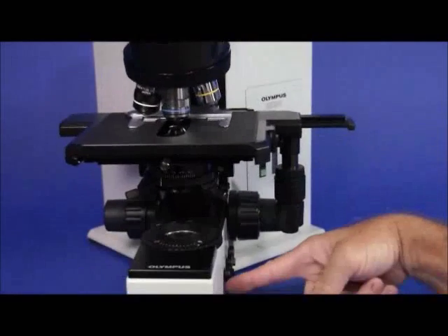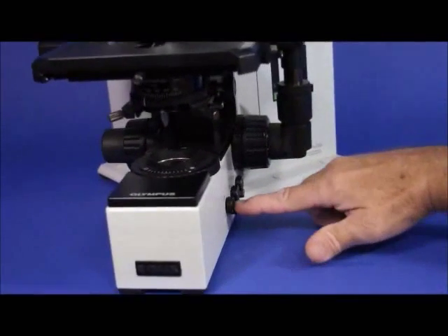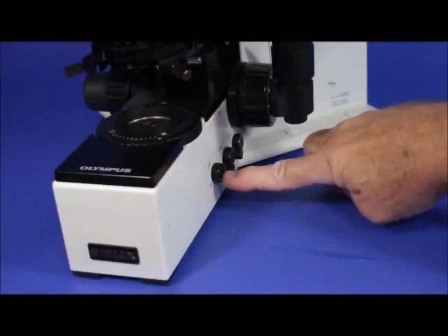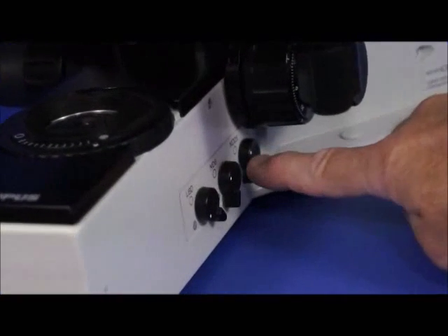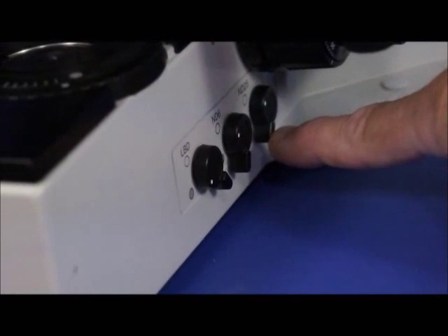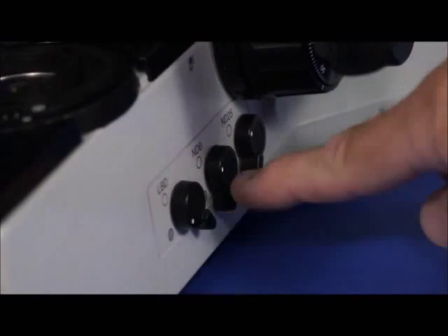Moving just a little bit further down and to the right, you have a set of filters. There's a light balancing daylight filter. There's a neutral density 6 and a neutral density 25 value filter. There's three filters all together.